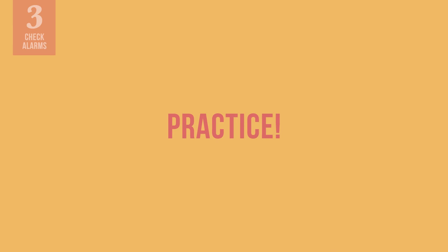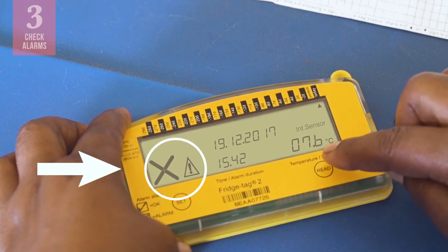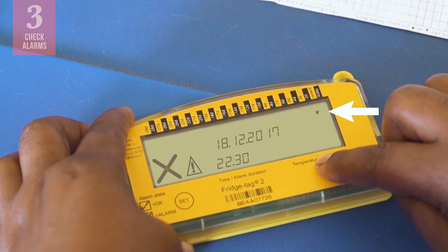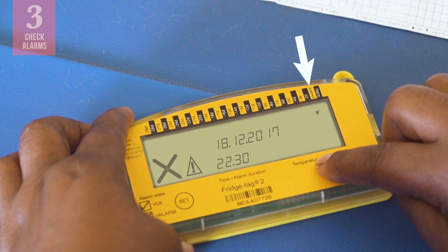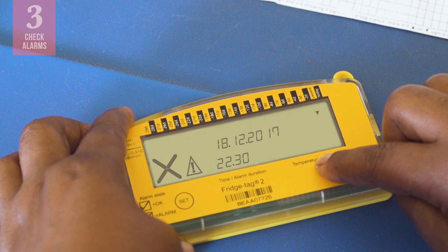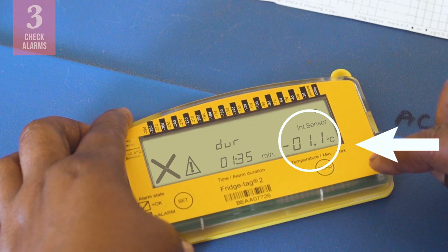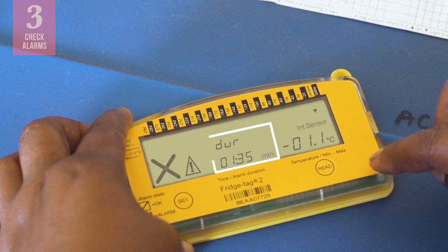After you have looked at all of the details for a particular alarm, the warning symbol will disappear. Let us practice. On this fridge tag, we can see that there has been an alarm. When we press the Read button, we see an arrow pointing down, which means that this alarm is due to low temperatures. The arrow is under the word 'yesterday,' so we know when the alarm occurred. We can also see the date and time of the alarm here — it looks like this alarm occurred yesterday at 10:30pm. If we press the Read button again, we see that the lowest recorded temperature was negative 1.1 degrees Celsius, and that temperatures were too low for 1 hour and 35 minutes.